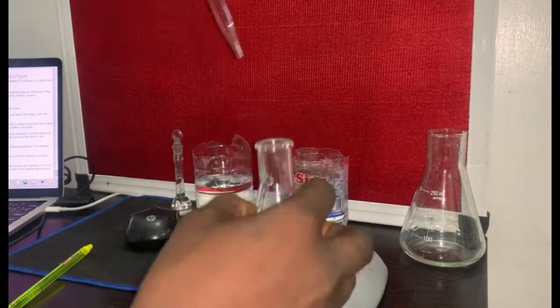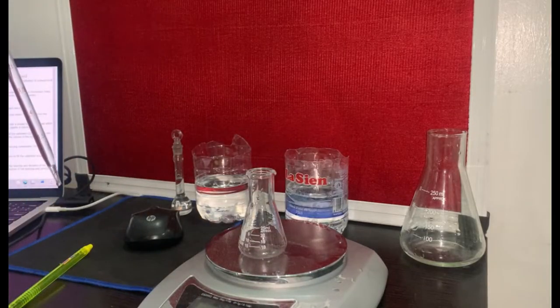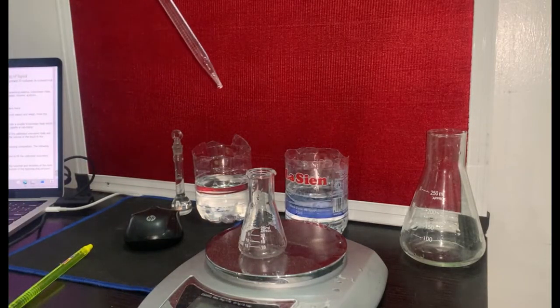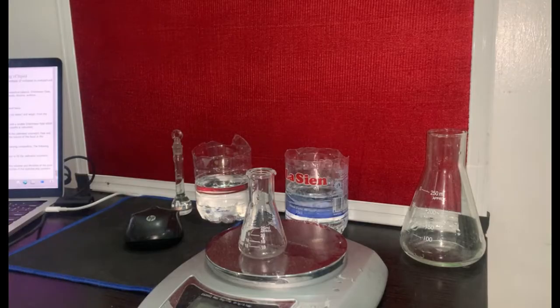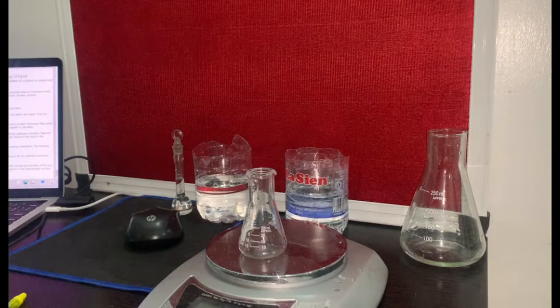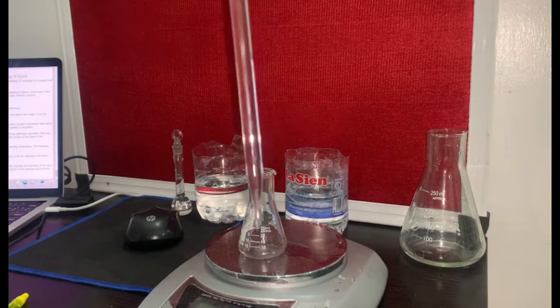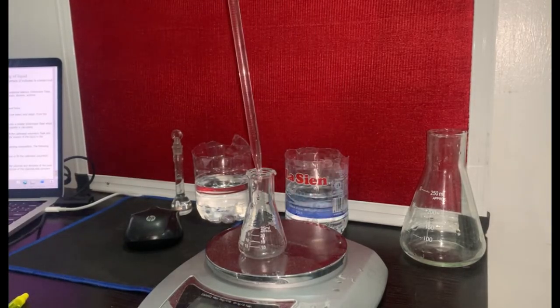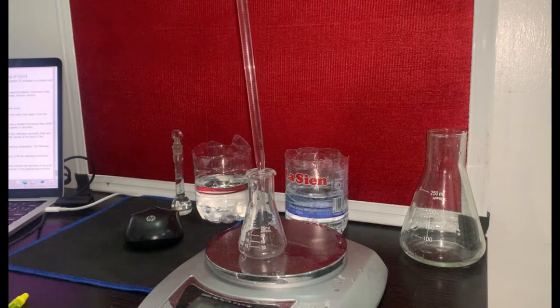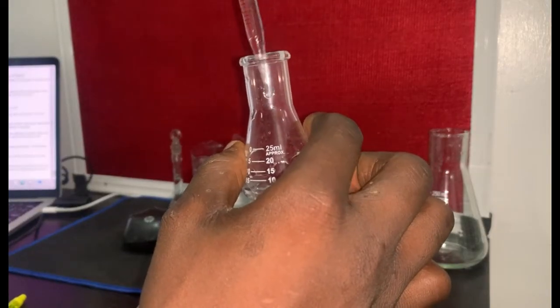If you transfer one of this into this flask and weigh, you're going to get 26.52. That is the mass of this flask plus the mass of this 5 ml of water inside of this.